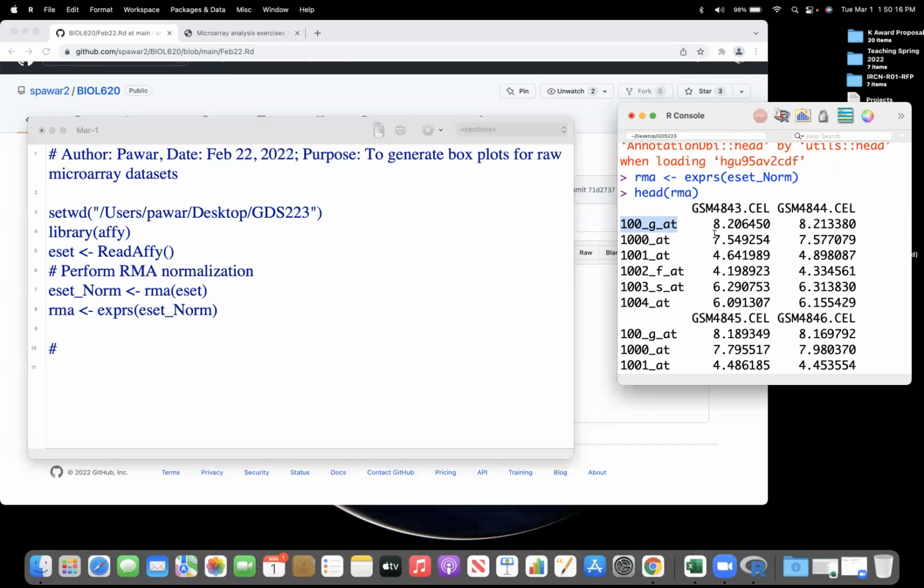In this example, I don't know what the cell files are, which is the treatment and which is the control. We have 5 cell files, so let's assume that the first 2 files are treatment and the next 3 files are control.